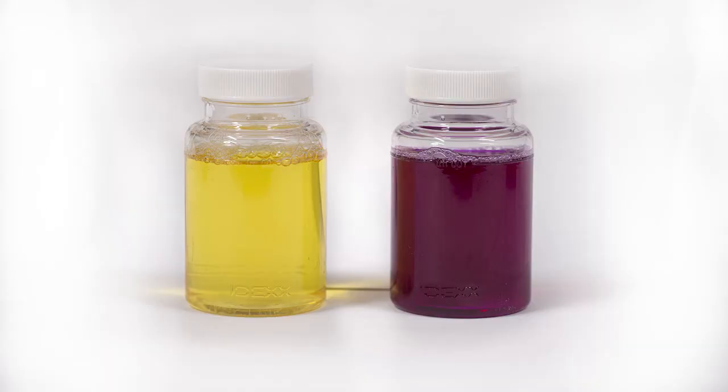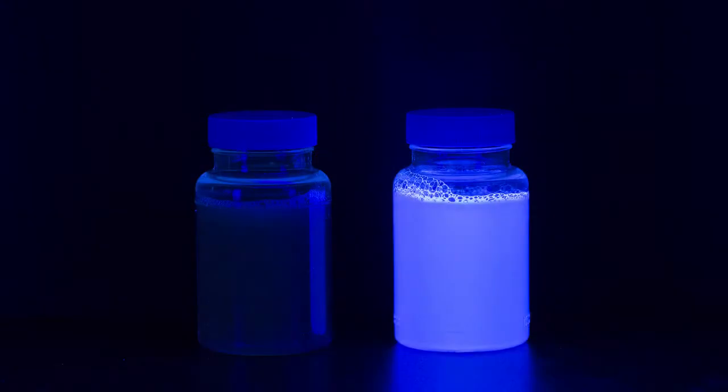After 24 hours of incubation, if the sample is magenta, it is positive for total coliforms. If the sample is magenta, determine E. coli results by shining an ultraviolet lamp on the sample in a dark environment, shining the light away from your eyes. Keep the light within 5 inches of the vessel. If the sample fluoresces, it is positive for E. coli.